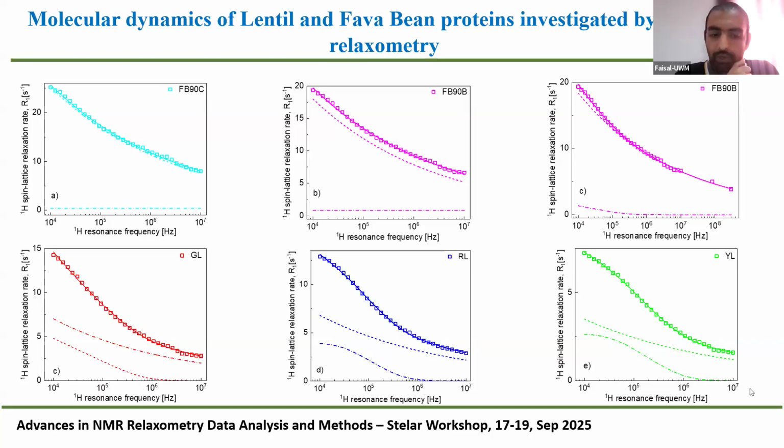Yeah, but I want to ask, if we increase that value, obviously it will increase the time of our sample. But if we increase the value, does it really matter in measuring the curve? Because I know that if we increase the number of scans, we have a good, beautiful curve, we can say.